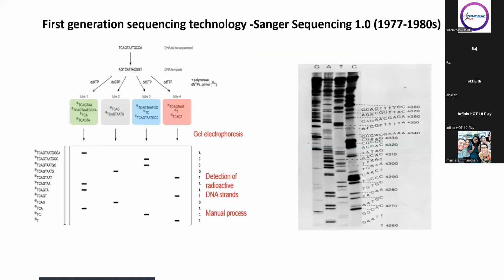So now let's talk about the first generation sequencing technology. Let's take the example of Sanger sequencing.